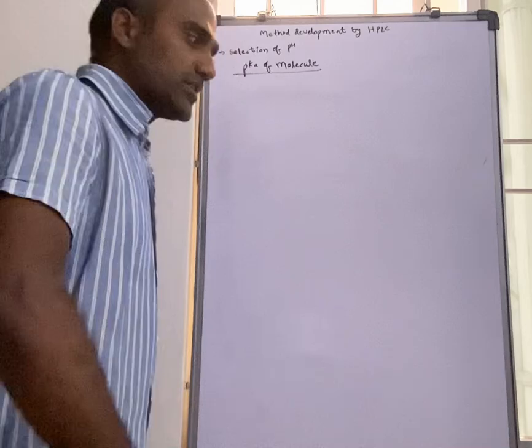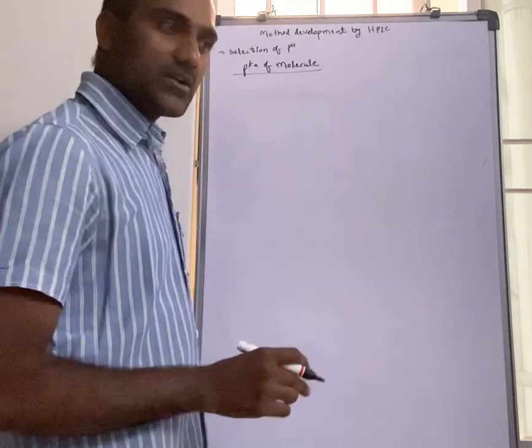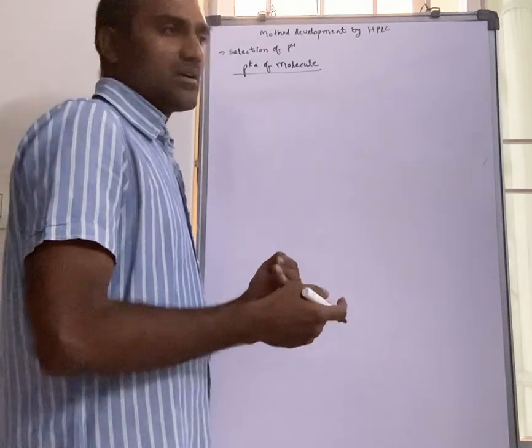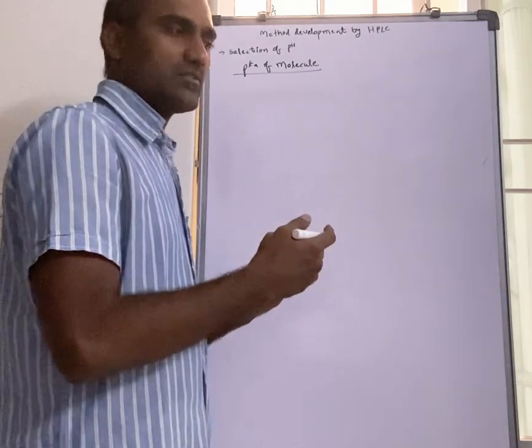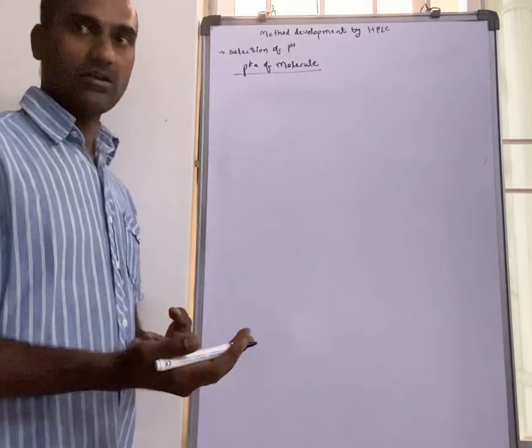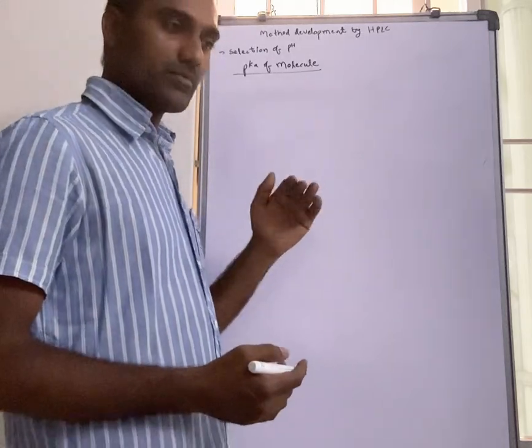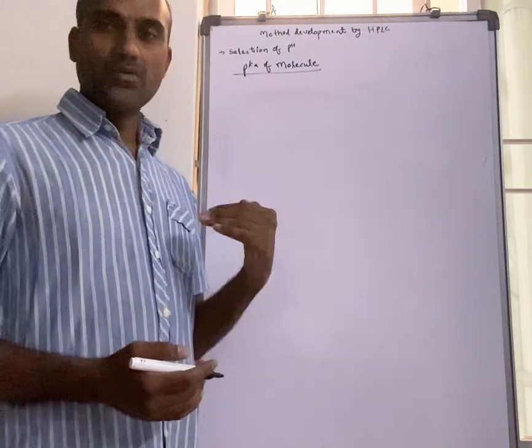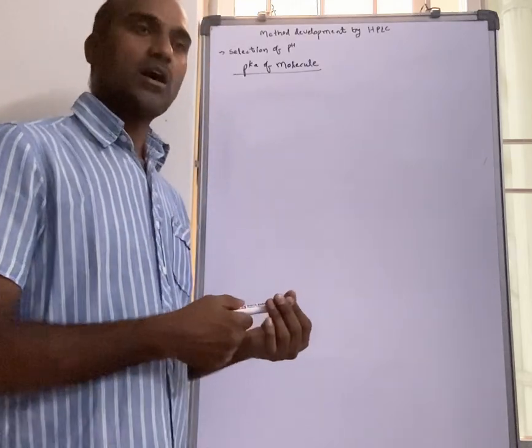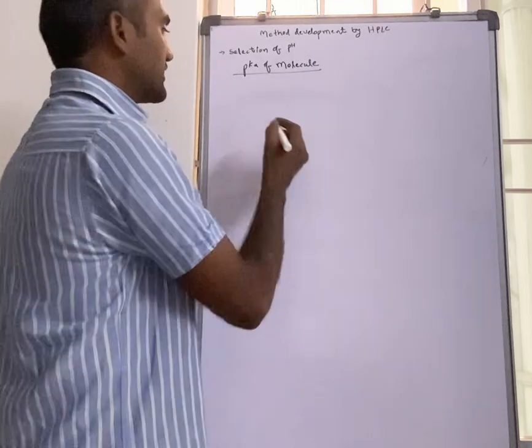What are these ion pairs, and why will we use them? Peak shapes are not good when molecules are not in a single state. If ionized, they may elute very early; if not ionized, they may elute very late and broad. So to reduce these problems for some rare molecules, we will use ion pairs. We also use ion pairs sometimes for non-responsive chromophores. Okay, ion pairs.